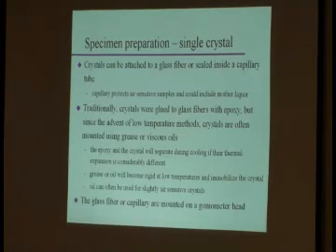And the reason for that is that in the old days, people used to run experiments at room temperature. Nowadays, very few experiments are run at room temperature. You usually run with a liquid nitrogen stream, at -100 centigrade, something like that, okay? Now, why do you run at low temperature? Well, it cuts down on thermal motion, so it makes your atoms look prettier, okay? They are more well defined. You don't have to worry as much about where they are located, especially for the light atoms.